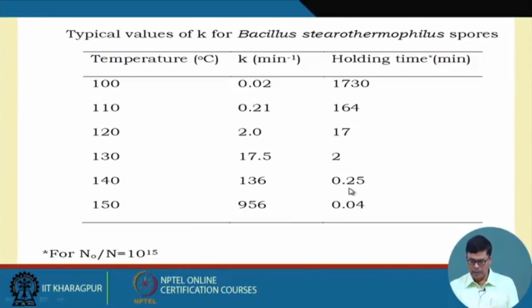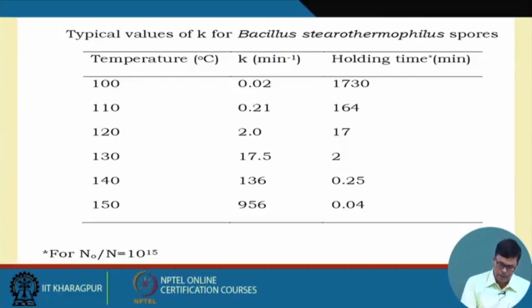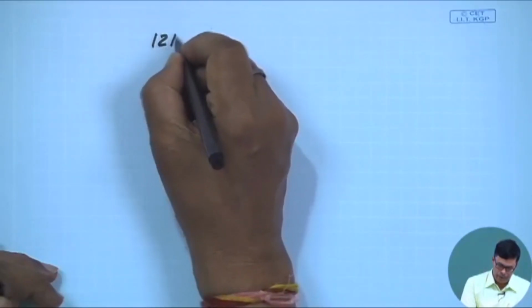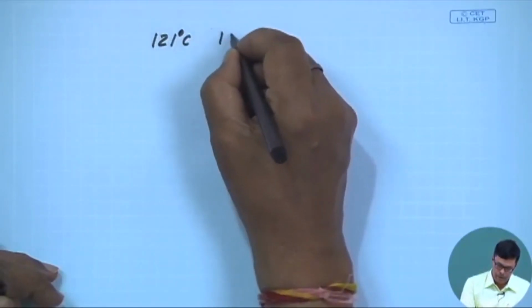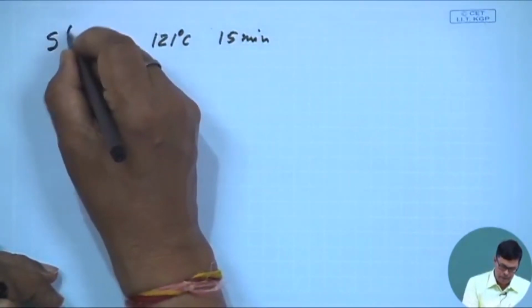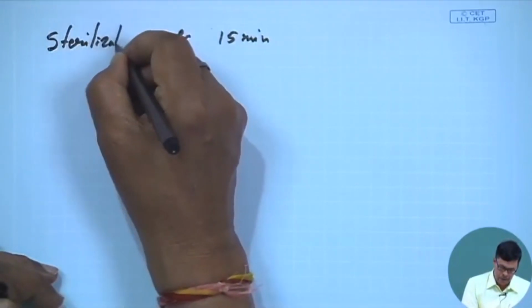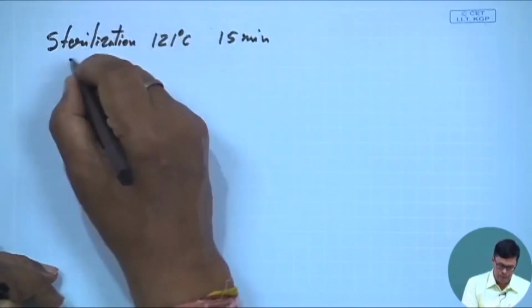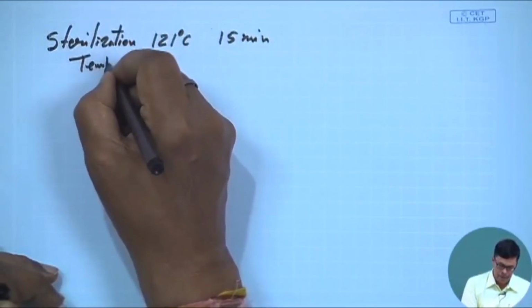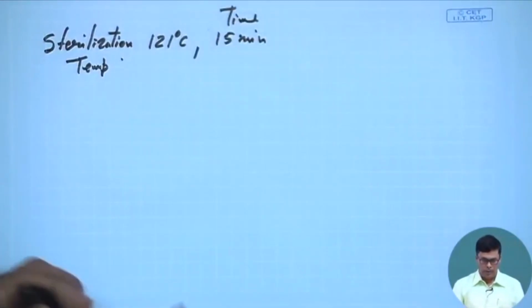Now, in the laboratory our sterilization temperature is 121 degree centigrade for 15 minutes. This is the sterilization temperature and time requirement.